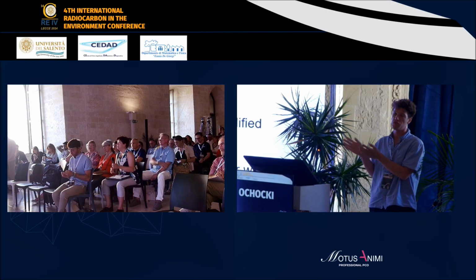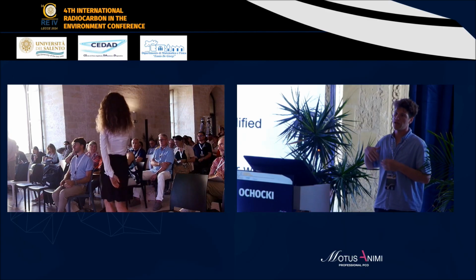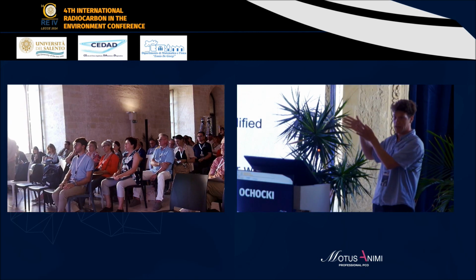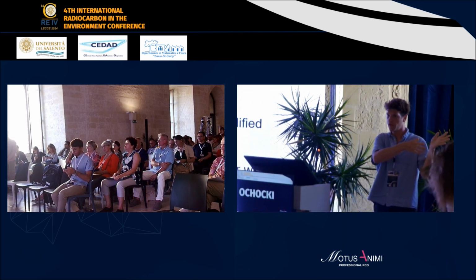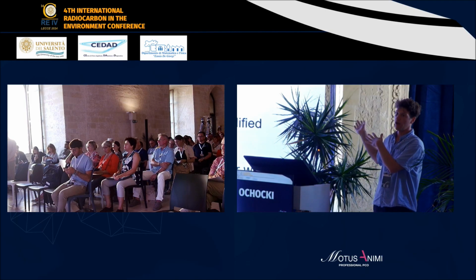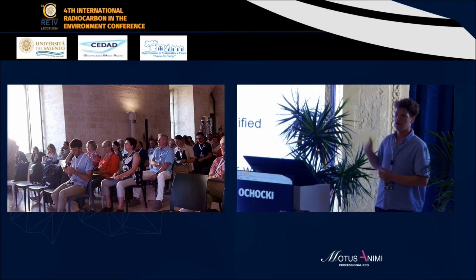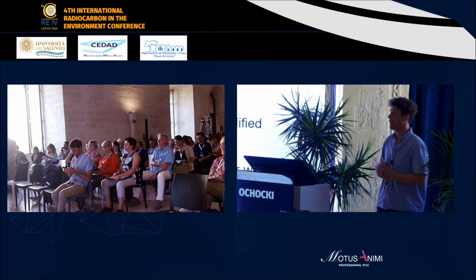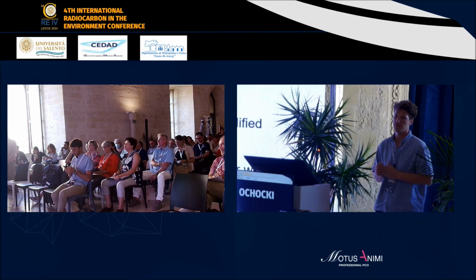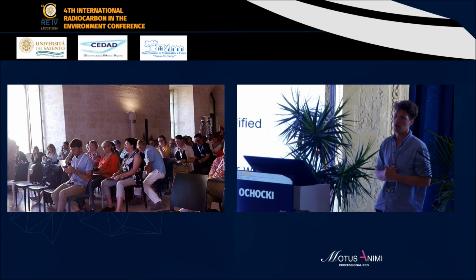We sort of routinely use background charcoals, and I didn't show that data. I did the same: I went to the archive, got the already ABA-treated material and dated those as well, and we saw no change. I didn't include those as I thought it would complicate things because we didn't see any difference between the steps. But yes, we processed the standard in the same way alongside the steps.